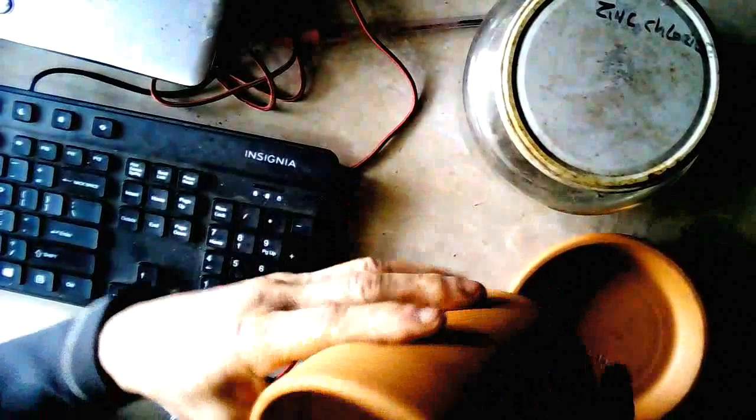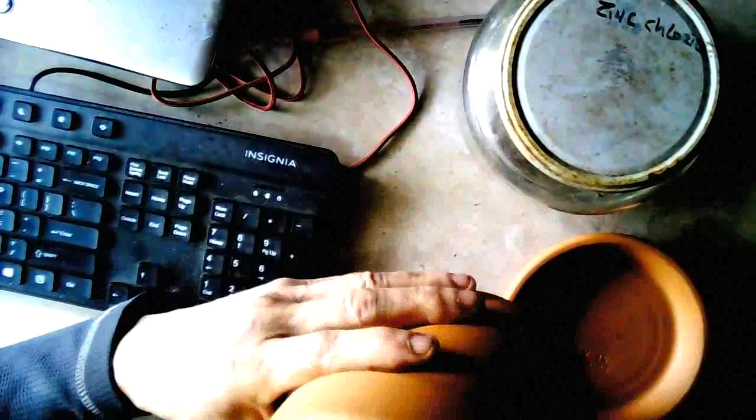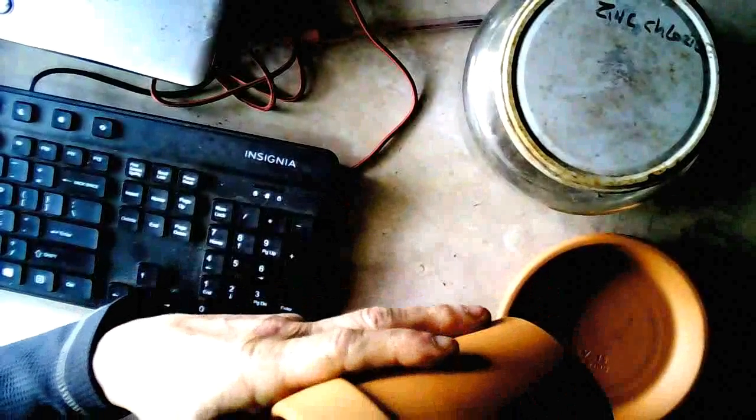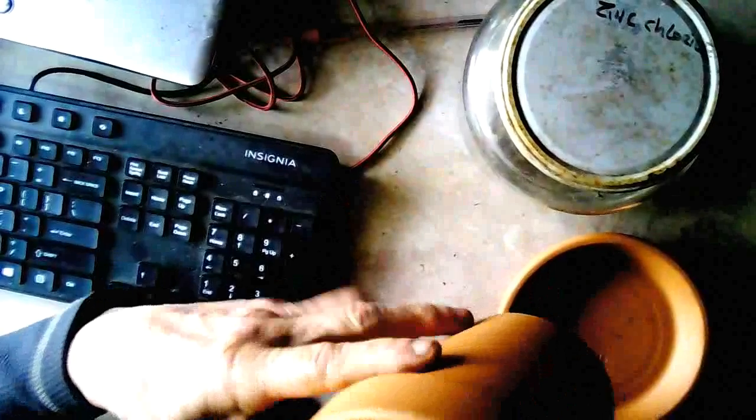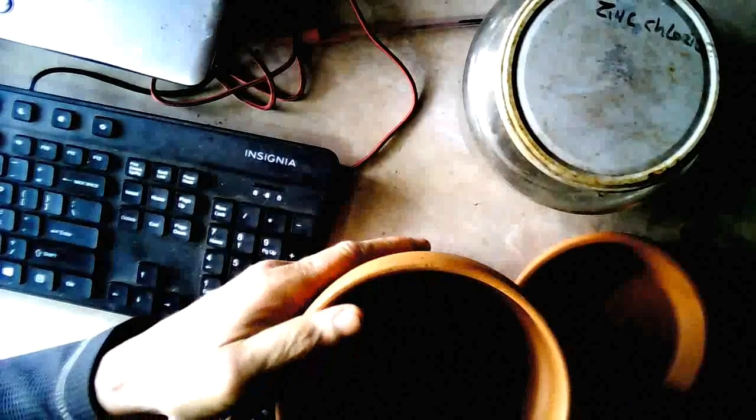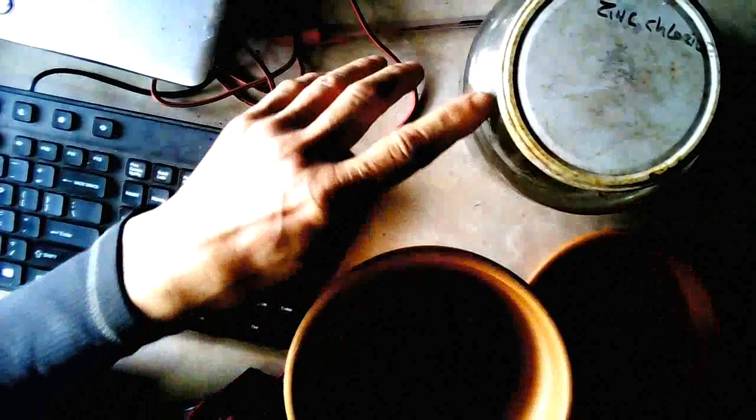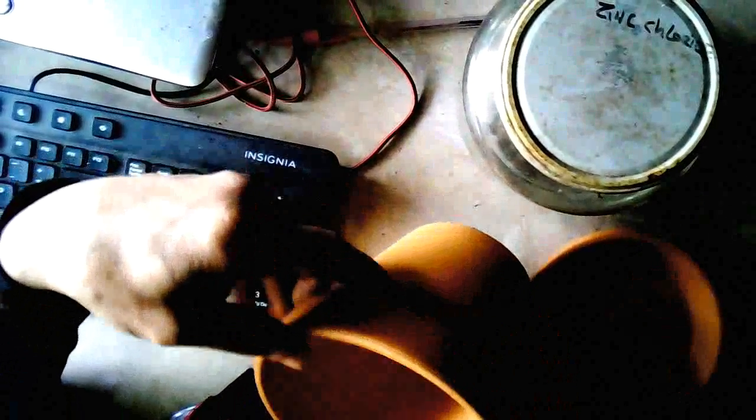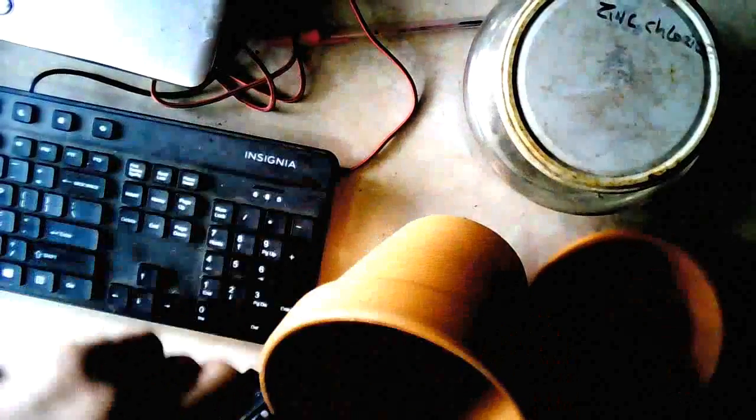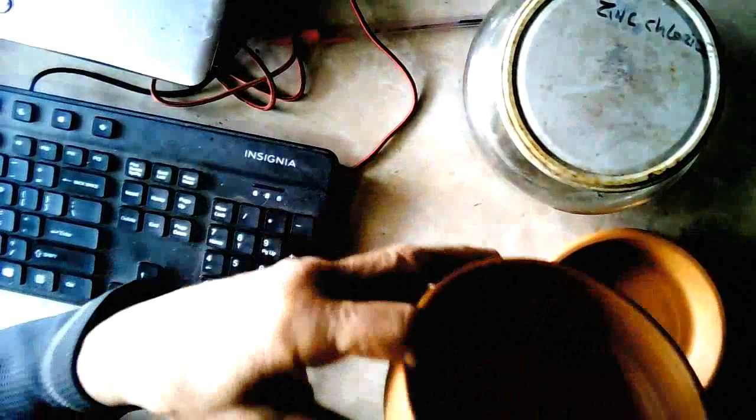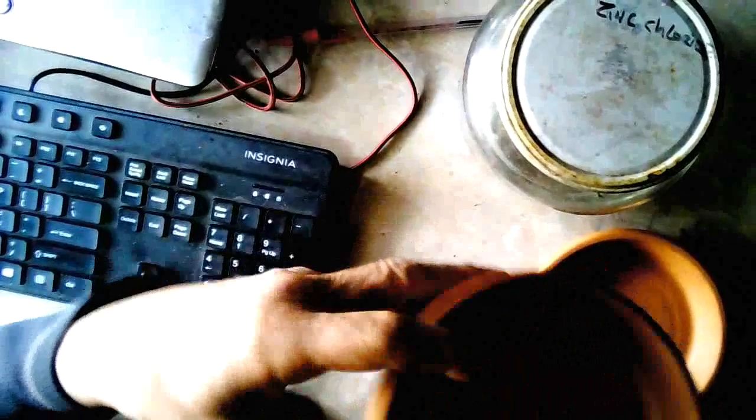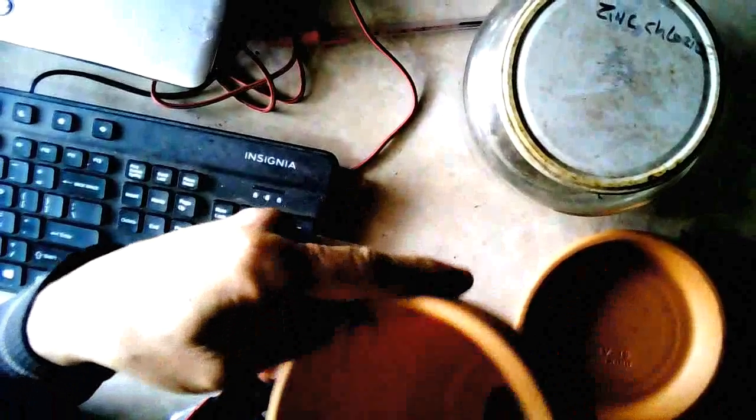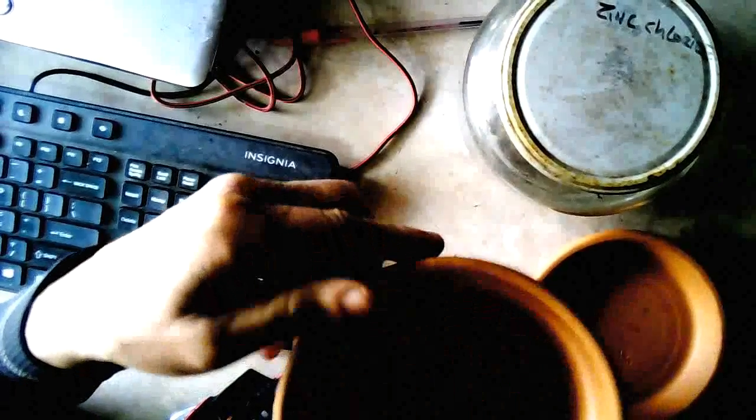So get a clay pot and seal the bottom of it with some hydraulic cement. And then what I'm going to do is take this zinc chloride here and coat the inside of this pot with it. It's porous so the zinc chloride will soak into the pot and we'll have a pot that's saturated, well maybe not saturated but it'll have the zinc chloride in the pot.